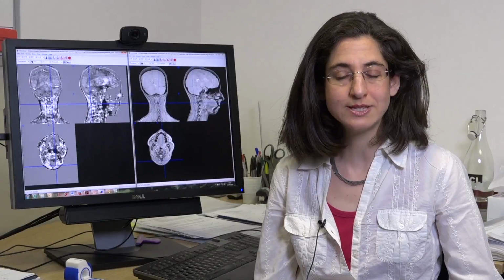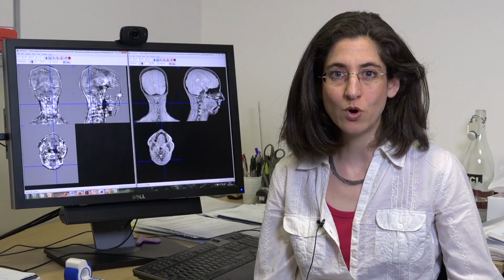So Umber Chima is going to tell you all about 3D tumoroids, how they're constructed and what they will allow us to do. My name is Umber Chima. I'm a senior lecturer in tissue engineering, and recently we've been developing 3D in vitro models of cancer, which we term tumoroids. Now, tumoroids, in essence, are biomimetic models of cancer. So we try to represent the real tumour environment.